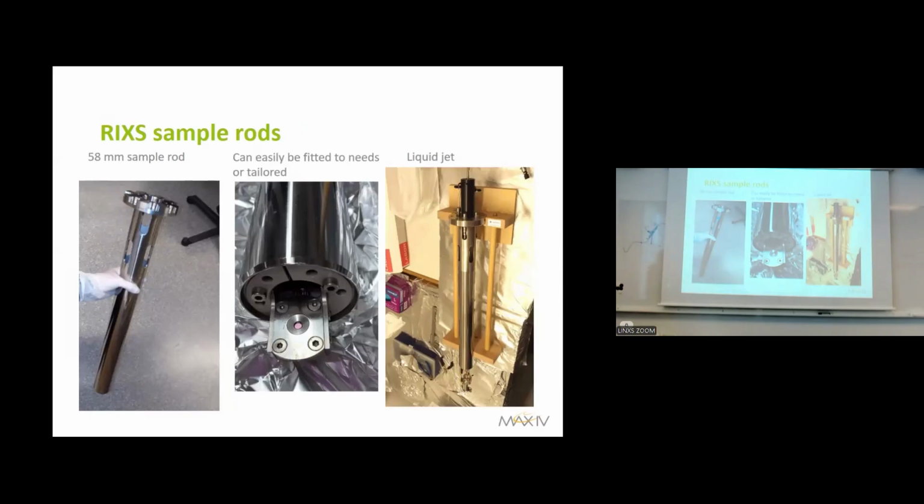Samples, as I said, we have this simple RIXS or simple manipulator setup. So this means that we have a form factor of our sample environment. It should look like this with all the measurements that we have. And then you get access to all the stability that we have. This means that we can tailor things with our users. If they come with an idea for a setup that they want to do, we can then collaborate and build a setup for you or with you.